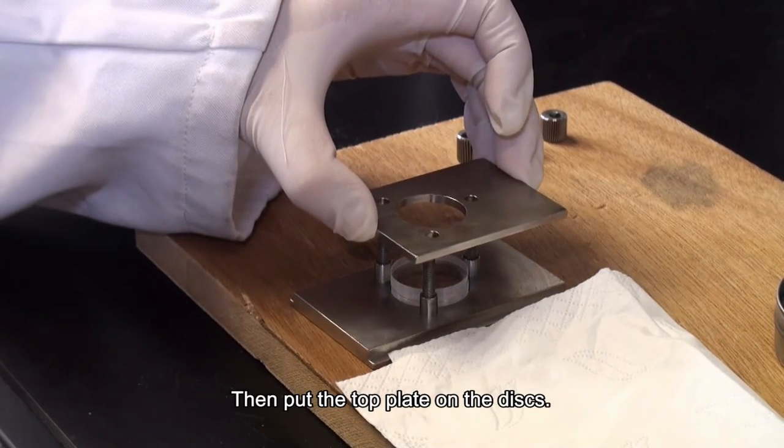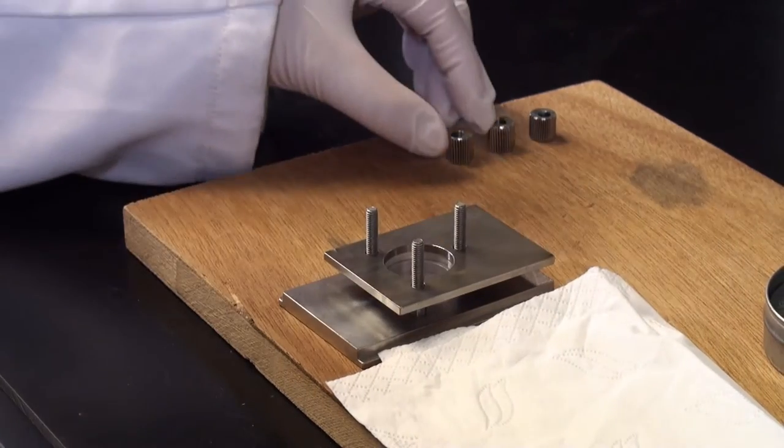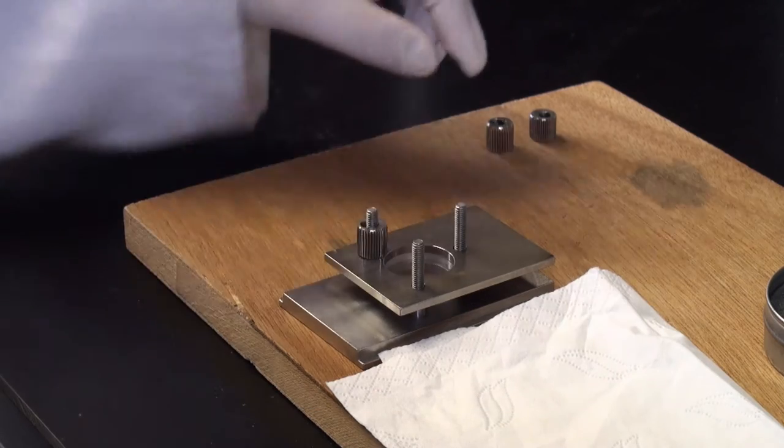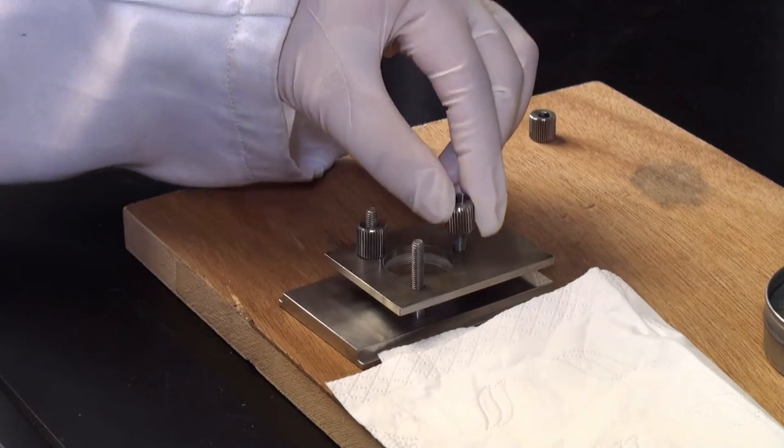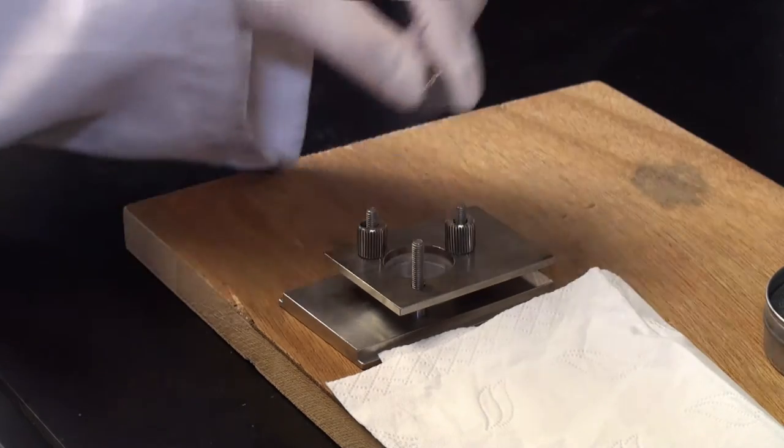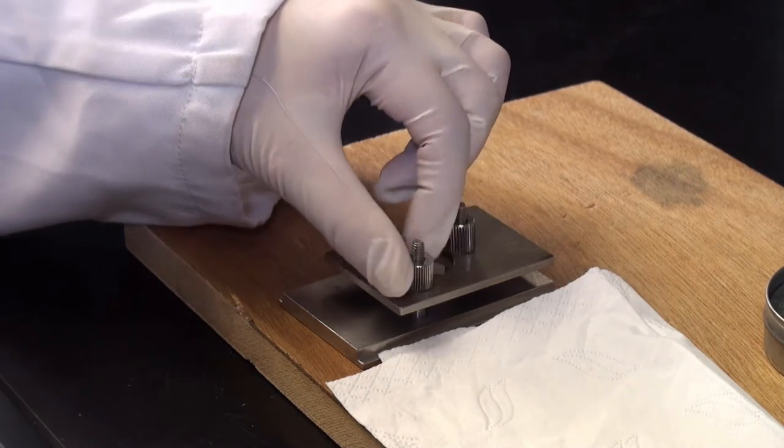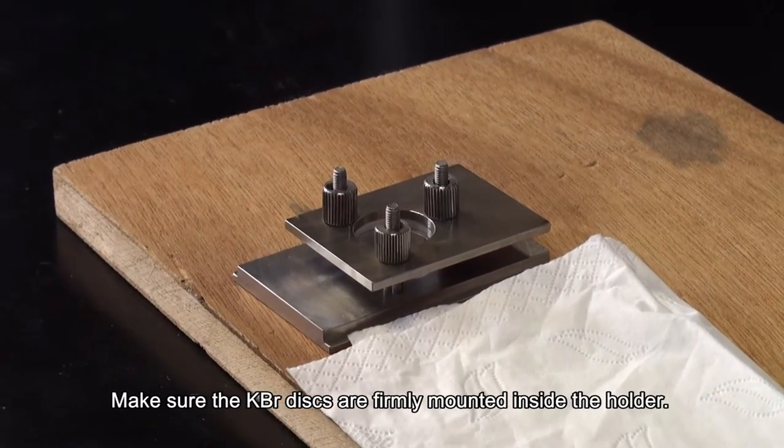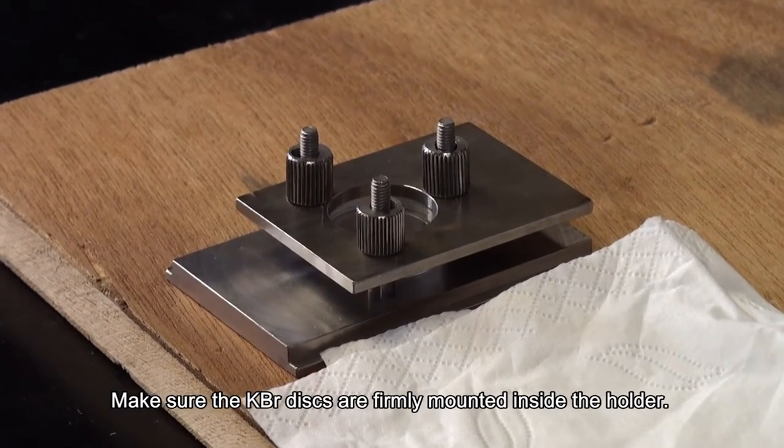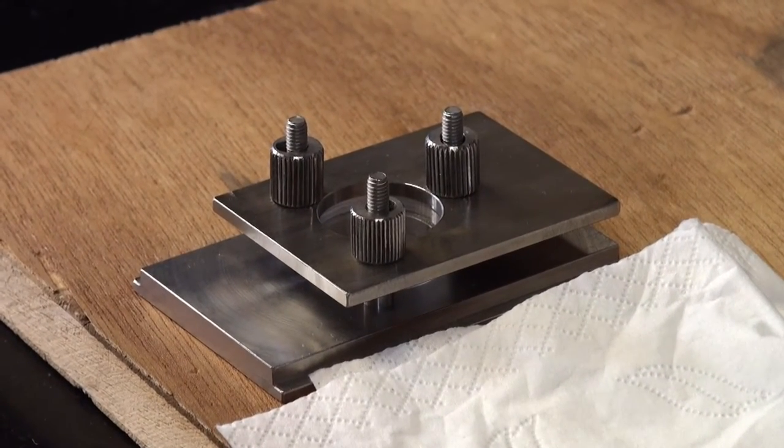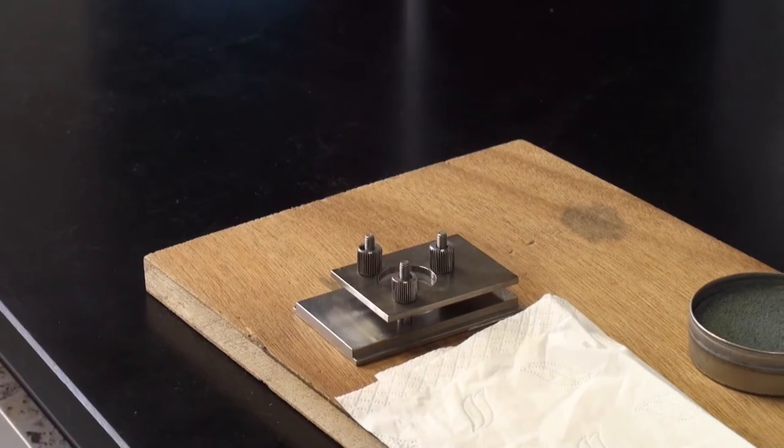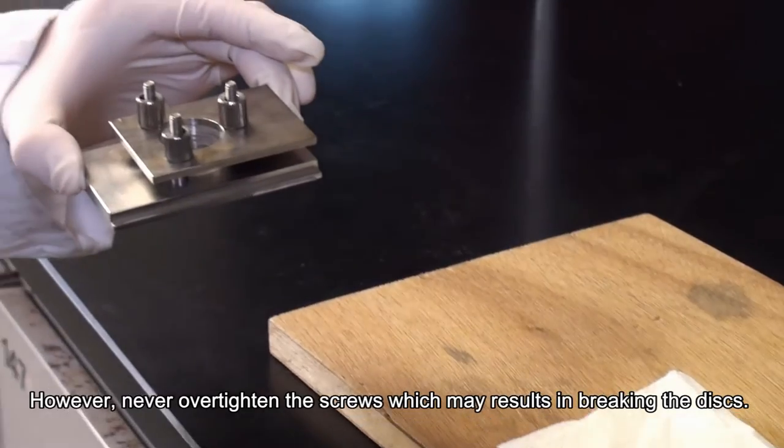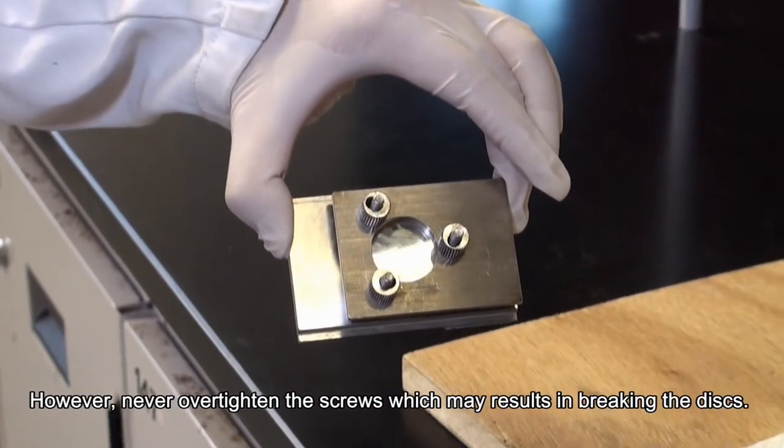Then, put the top plates on the disk. Gently tighten the screws. Make sure that KBr disks are firmly mounted inside the holder. However, never over-tighten the screws, which may result in breaking the disks.